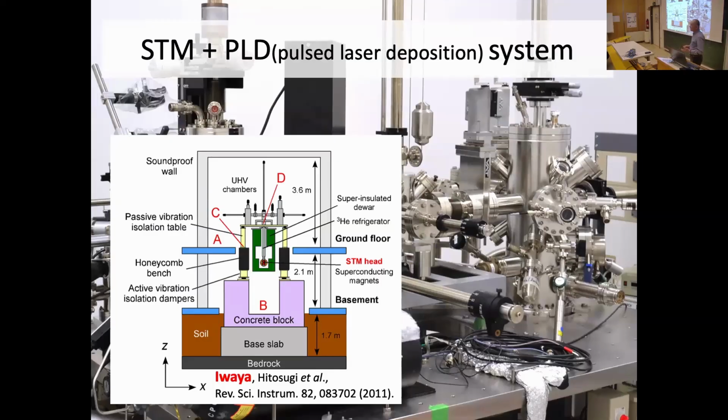Did it work? Was it the highest resolution? Yeah, it is. It is now. The STM is still there, and it's still high resolution, thanks to this large base slab. The resonating frequency is very low, and very high resolution is possible.